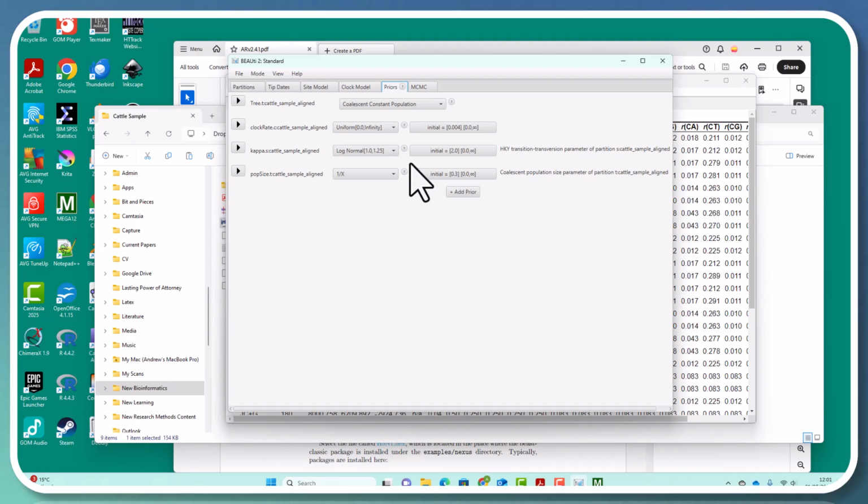So the rate of mutation and the population are two parameters that are linked together intimately in the equations, which determine how rapidly something's evolving. And you can't really separate the two. So this is not going to be a real population. It's going to be an artificial number in the population. And that's the first part of it set up.